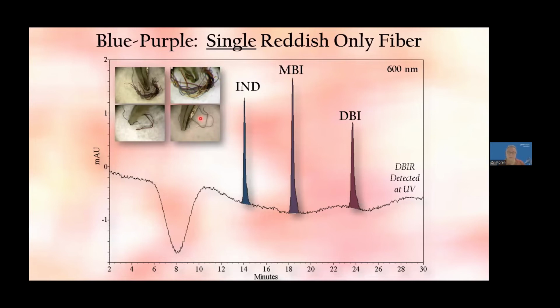But this is just to emphasize the fact that even a single fiber can give you, which is amazing, such a wonderful chromatogram as if it was dyed today.